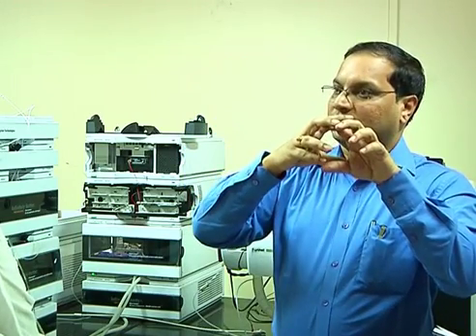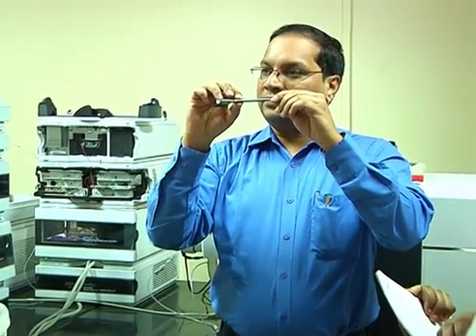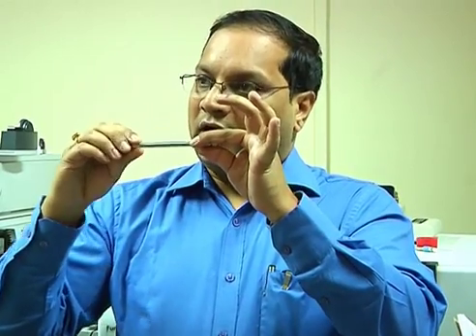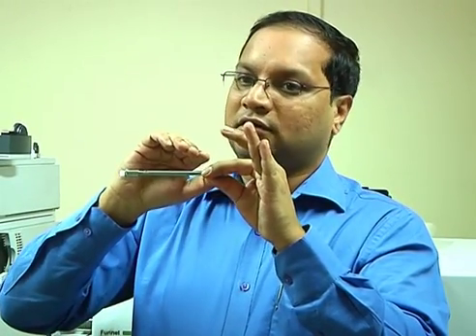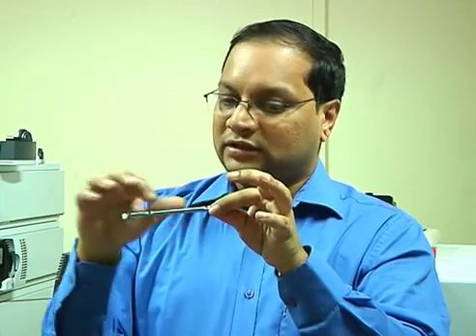Broadly, the pumps will pump the mobile phase, where A is water, let us say. So, by loading the sample, we'll use more aqueous, so that your peptides get retained on the column, the stationary phase. If this is my stationary phase, depending upon hydrophobicity, of 10,000 peptides few will bind here, few will bind there, and they'll get spread across the column, retained based on their hydrophobicity. And you can run for a while with aqueous only, so that any salts or other things get washed off, and you get enrichment of your peptides. Then what you do is slowly increase the acetonitrile content, which is also called an organic step gradient or organic gradient. You slowly increase the organic content and reduce the aqueous content, so that the polarity is now changing, and depending upon their binding capacities, they will cleave off from this and start eluting.